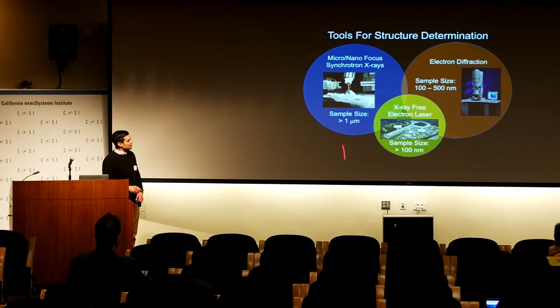And these are the types of machines that I'm talking about. On the left are these synchrotron X-ray facilities that generate beams of X-rays that impinge on a sample, and you're detecting the types of interactions that happen as a result of that. There are even bigger facilities that are brighter, and this nice line, which is almost a kilometer long, illustrates one of these lines. At the end of this is your sample, and it's being impinged by X-rays.